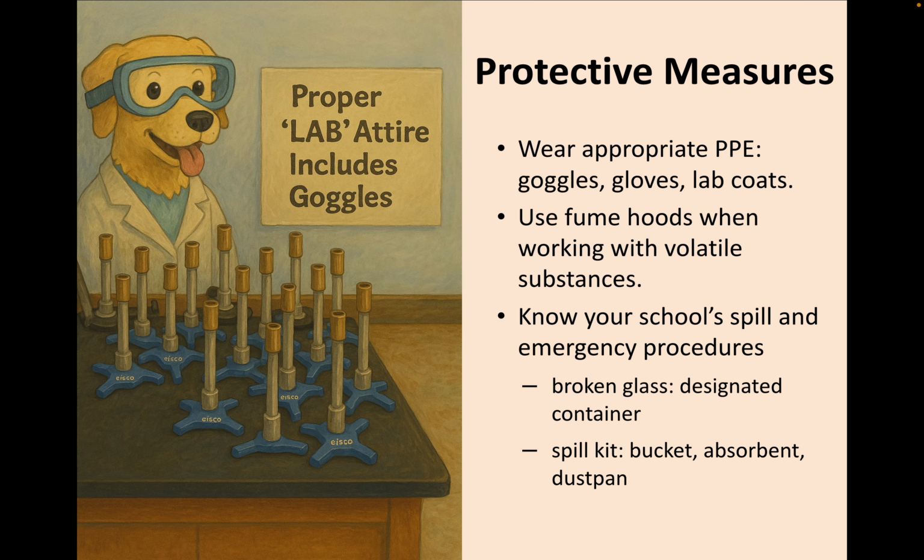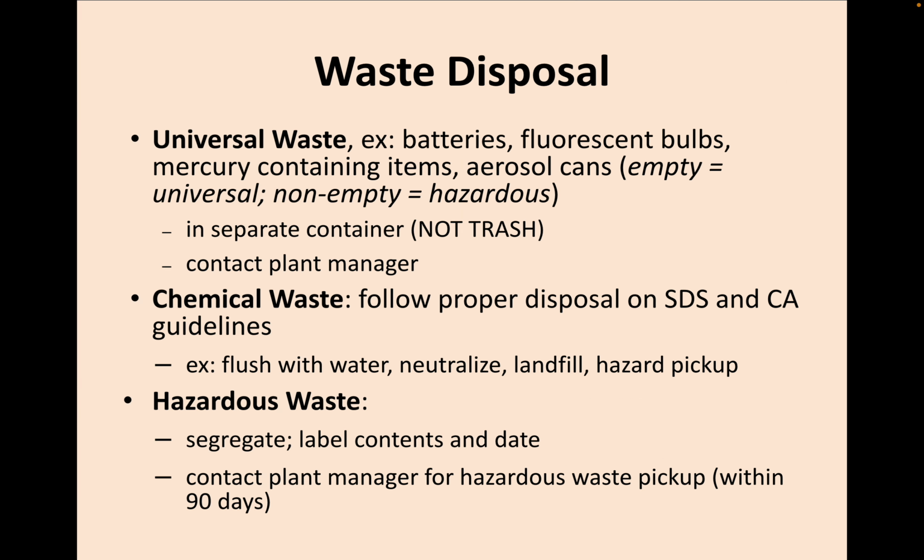You already know the drill: goggles, gloves, lab coats, they're all required. But don't forget the fume hood for volatile substances. Always know your classroom's emergency procedures, like where the eye wash station is or what to do if there's a spill. Broken glass should not be put in the trash, but into a separate container to avoid injury.